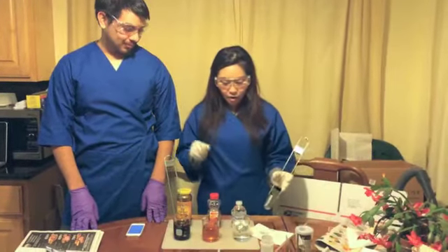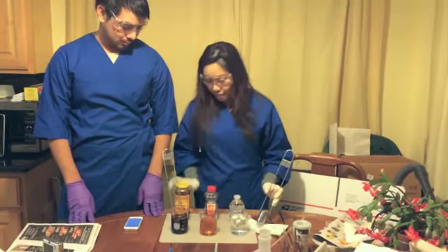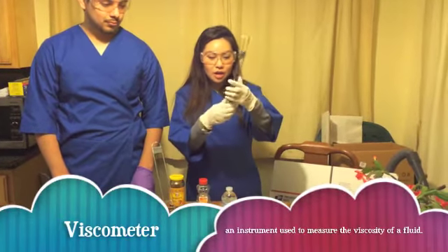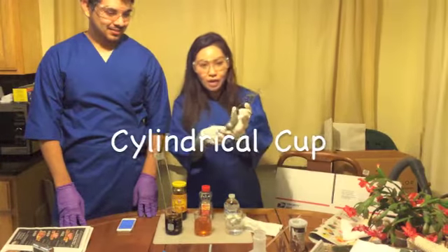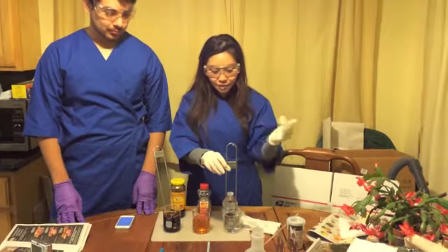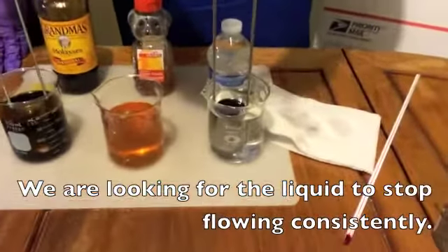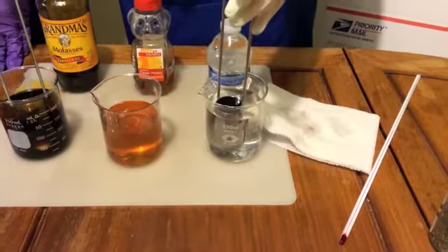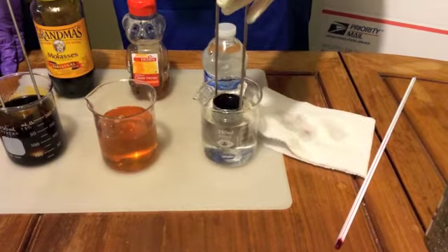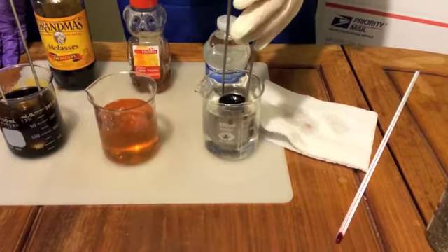Very true. So we've got three liquids: water, honey, and molasses. This is a viscometer, and it's a cylindrical cup. On the bottom there's a hole, and we're going to put the viscometer into each fluid, and it fills up to the top of the liquid. Then we will lift it no more than 6 inches, and time how long it takes for the liquid to break, and that will determine the viscosity of the fluid. So we're going to measure the time of water.